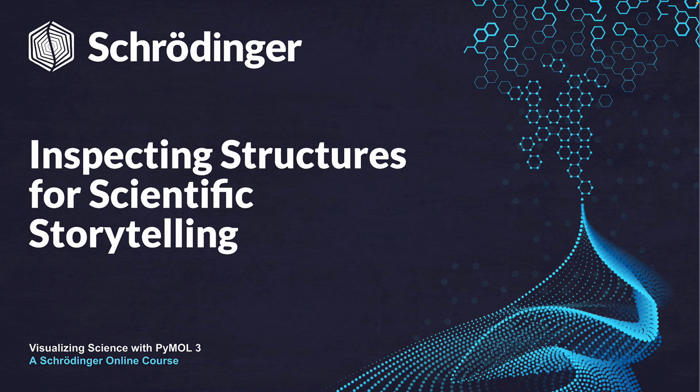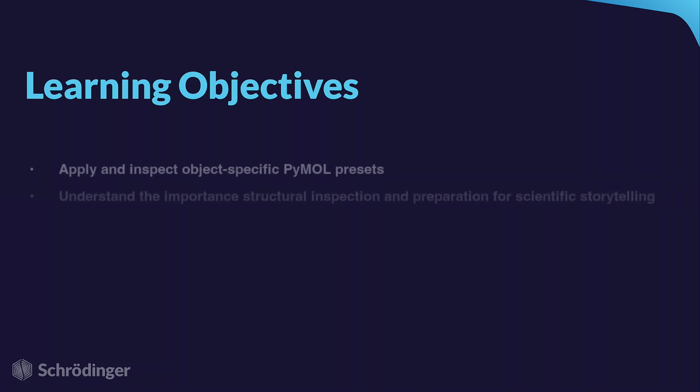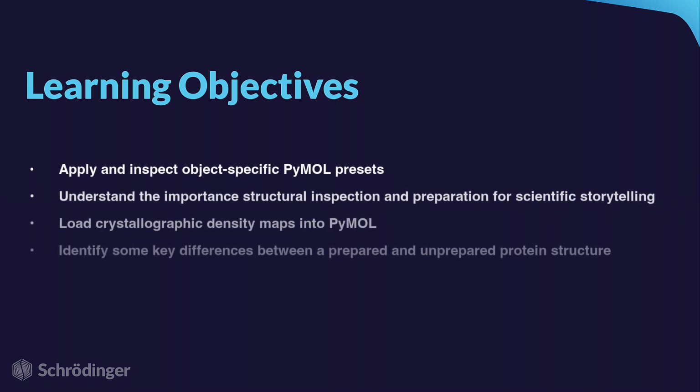Hello and welcome. In this video, we will be using PyMOL 3 to inspect biochemical structures and start thinking about the science of what we want to display. By the end of this tutorial, you'll be able to apply and inspect object-specific PyMOL presets, understand the importance of structural inspection and preparation for scientific storytelling, load crystallographic density maps into PyMOL, and identify some key differences between a prepared and unprepared protein structure.